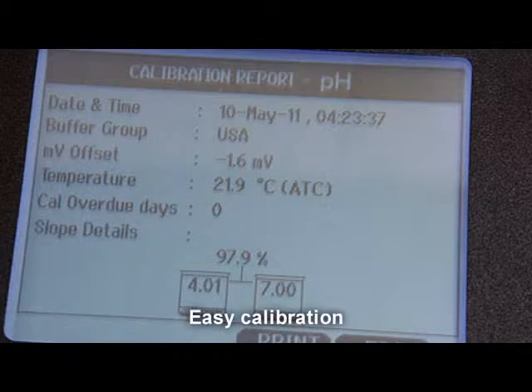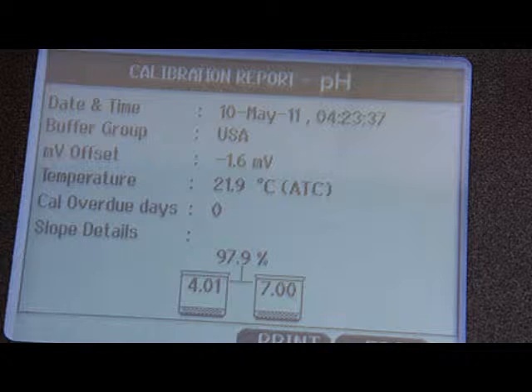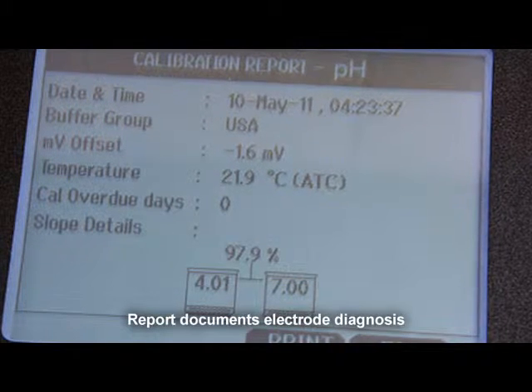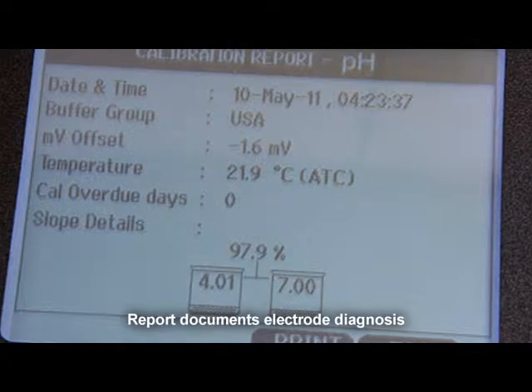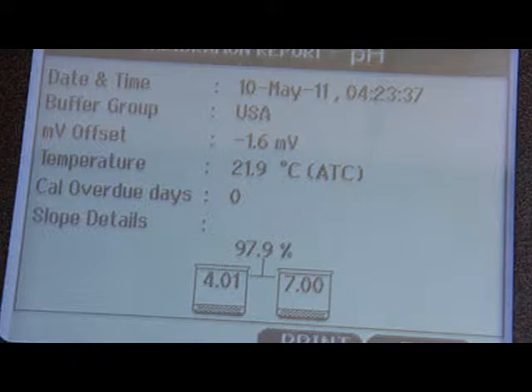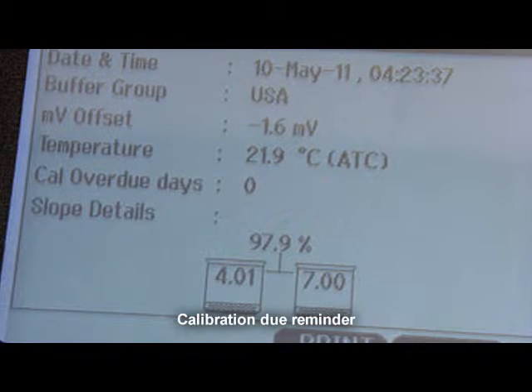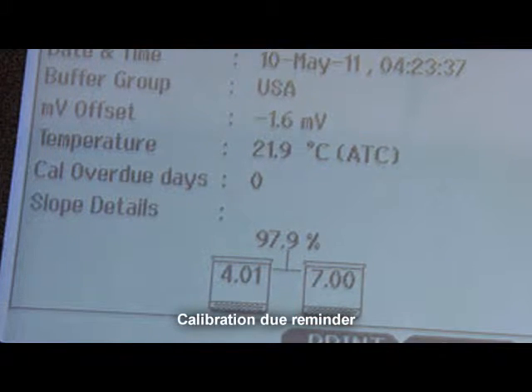Menu-driven screens guide you through calibration. Simply select your buffer group, as prompted by the screens, to calibrate. Results include offsets and slopes to indicate if your electrode needs servicing or replacement. You can also set the number of days until your next calibration — a flashing Cal-Due alarm will display when this date has passed.